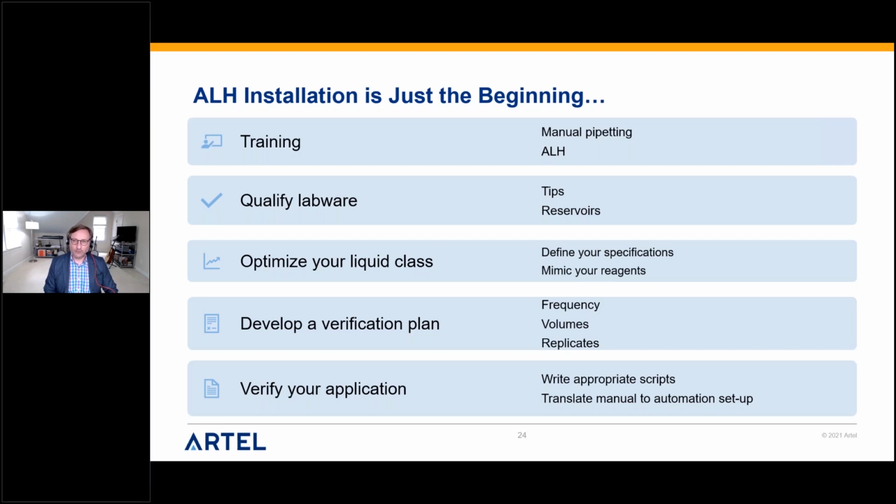It's a thicker, more viscous solution. When I'm pipetting, I make manual adjustments, just like that, hand-eye coordination. We just do it intuitively. We start slowing things up, and then we come over and we aspirate and dispense a little bit slower. We're paying more attention. An automated liquid handler doesn't do that. It does what you tell it. So what we're trying to do here is mimic what you're doing manually.